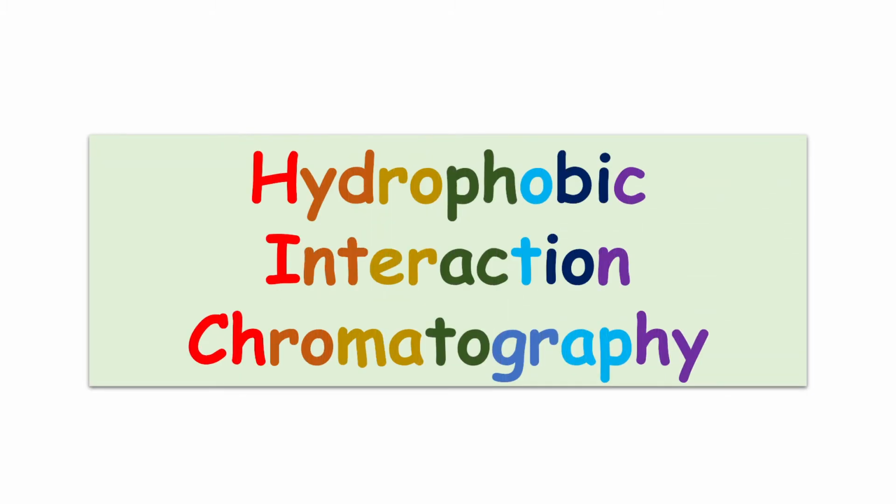We are discussing medical biotechnology, and in medical biotechnology we've been discussing chromatography. Today we are going to discuss a very important technique of chromatography, that is hydrophobic interaction chromatography.